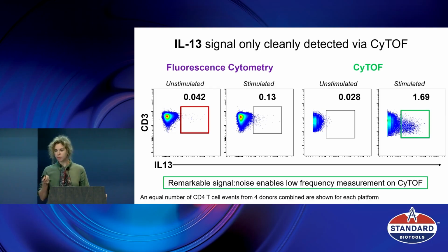I mean, with CyTOF, we know that there are buckets of IL-13 in the supernatant, and we can detect the cells easily, again and again and again. We've seen it so many times now, it doesn't fail to impress me every time I see this.